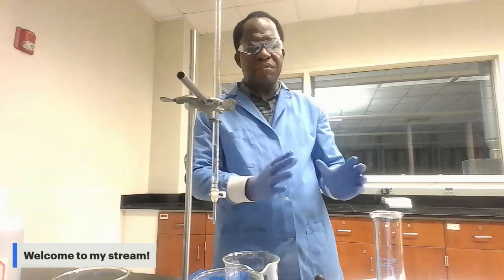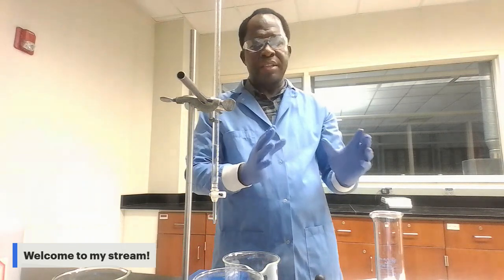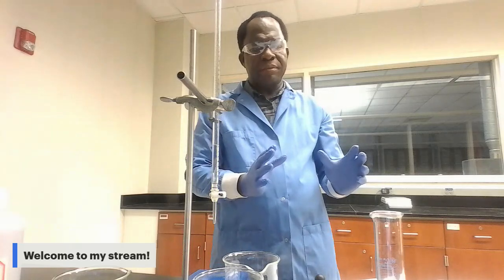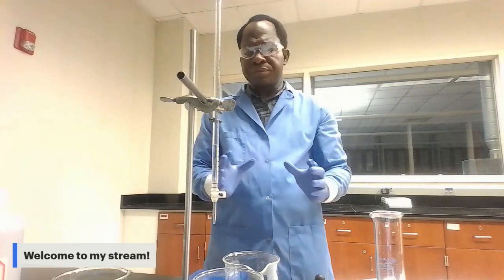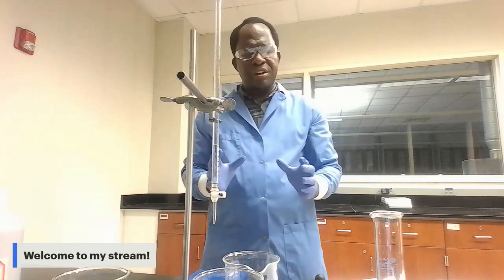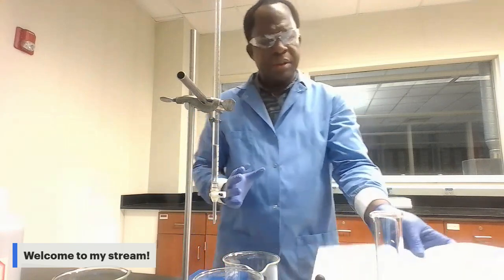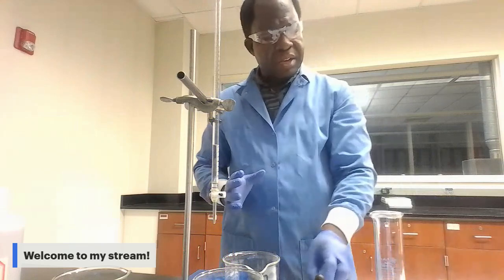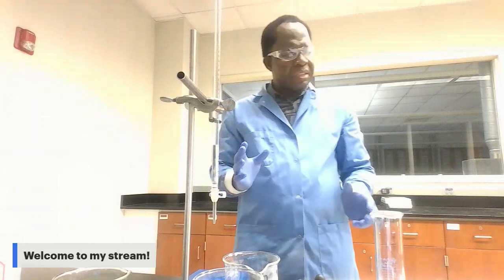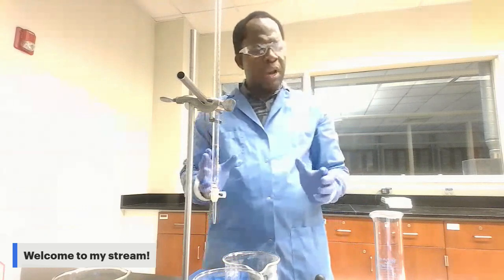You add the 3 volumes of HCl, and then you divide your answer by 3. It will give you the average volume of HCl you use to titrate each solution. With the calculation of that average, you can go back and use the stoichiometry and the dilution law to calculate the molar solubility.